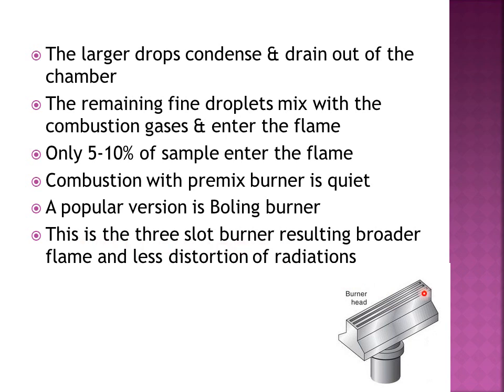You can see here the 3 slots, resulting in a broader flame. That is why the flame generated is quite broad. Because radiation comes from the radiation source and must pass through the flame, when the flame is broader there are lesser chances of distortion of these radiations.